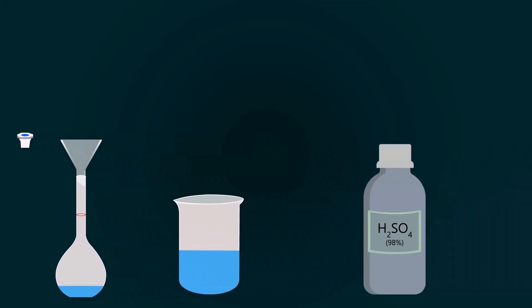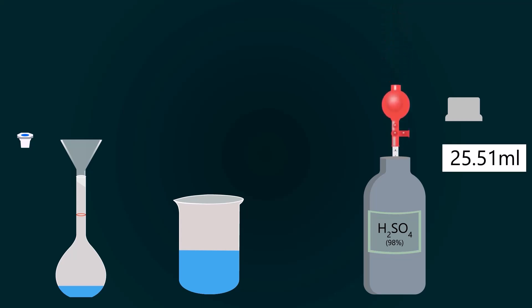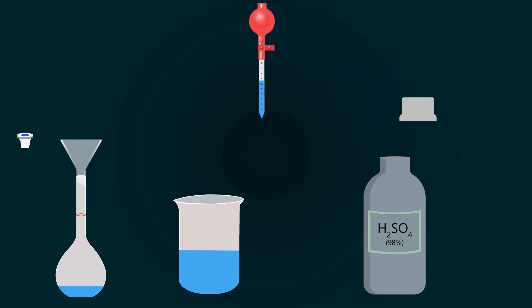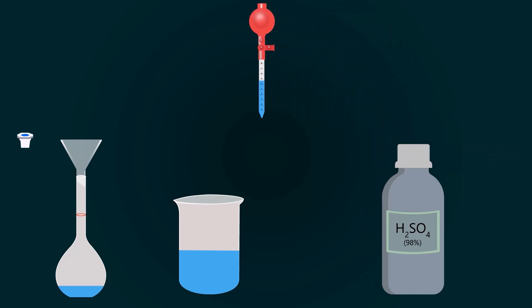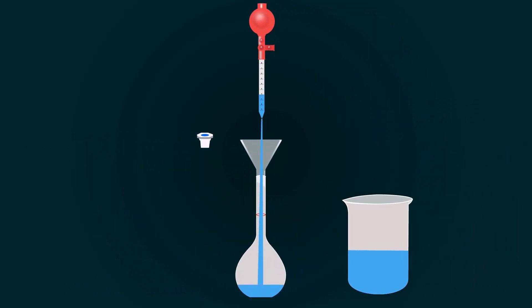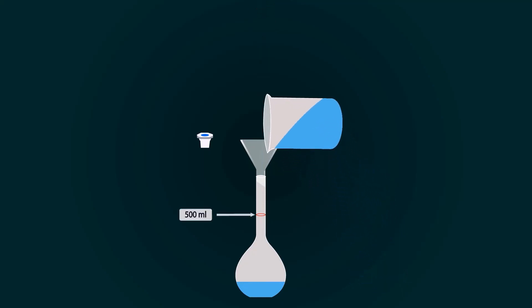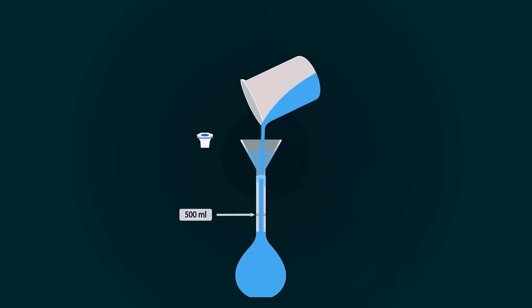Now take the bottle of 98% H2SO4, open the lid, and pipette out the required volume, which is 25.51 ml. Pour this into the volumetric flask. Now add more distilled water up to the 500 ml mark.